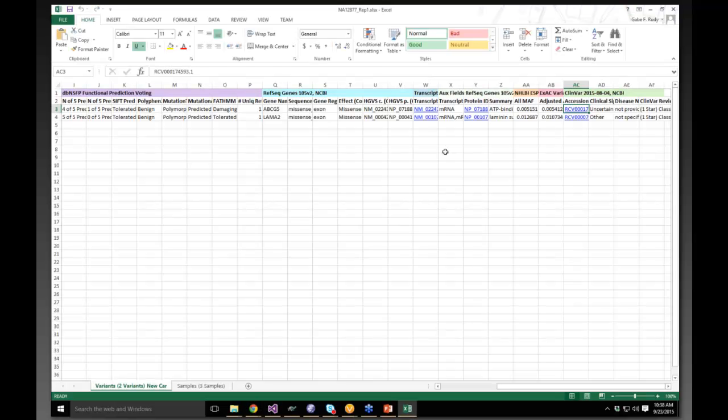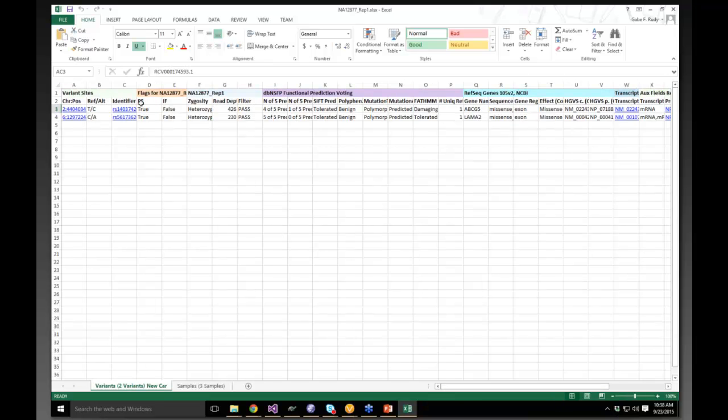So there's various different deliverables from a clinical test, including being able to archive or send on information, including all these rich annotations, and it even includes the status of that primary finding, the fact that this was our primary finding. We set that as true as a user.